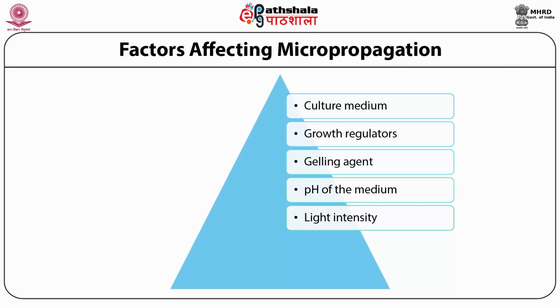The other thing is that the lighting also induces heating, and therefore it is advisable to switch on the lights during night when temperatures are comparatively lower. But maintain the photoperiod and the right light intensity. In most tissue culture labs, 8 hours a day is adequate, but it varies from 8 to 16 hours. And intensity is about 3000 lux. But it may vary from species to species, so that needs to be tested.